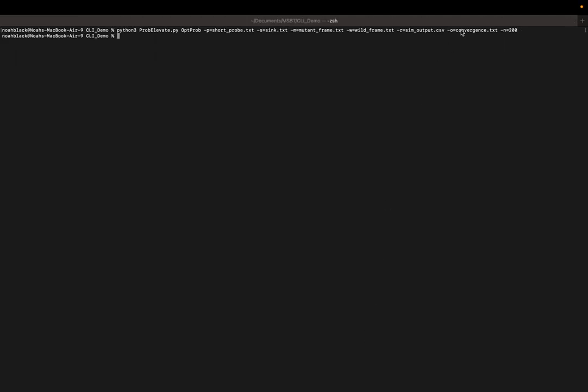You'll know when a simulation is complete when the next line in the CLI opens up for you to start typing. Now that we've run our simulation, we need to check that it's actually converged or worked properly. To do this, we're going to call another command called the physconv command. Again, we're going to specify the Python 3 language, this file, and then we're going to call the physconv command.